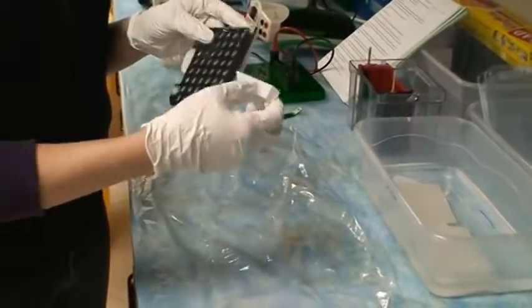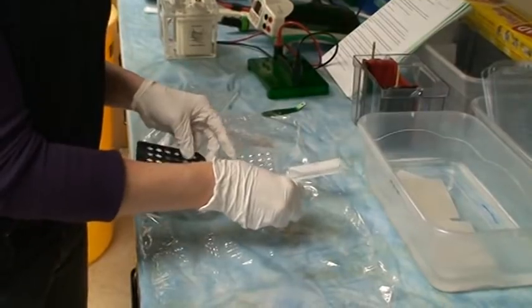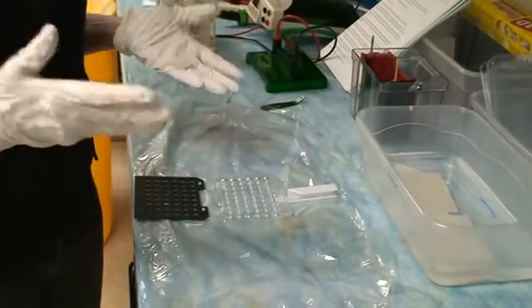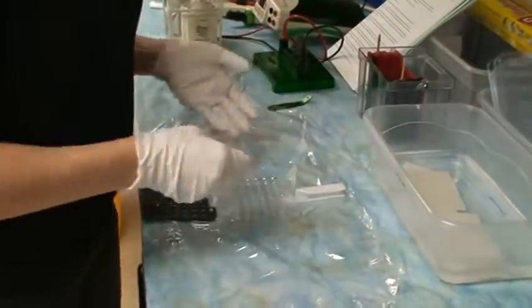You're going to open up this transfer cassette. So open it and lay the clear side down. The clear side is the side that your proteins are going to migrate towards. And then we're going to assemble this sandwich.